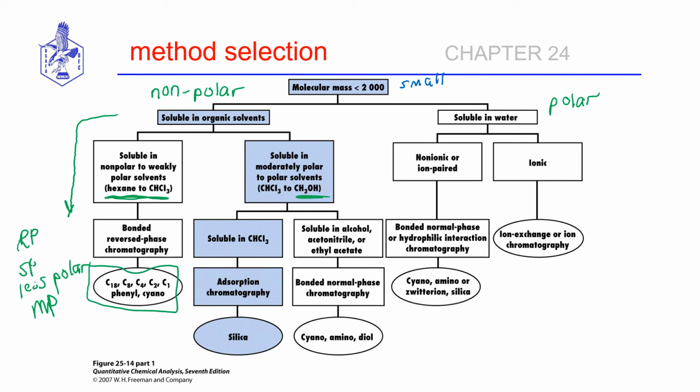If we have nonpolar compounds, but they're not as nonpolar as the previous case, then we're coming down this tree. Solubility in methanol, that kind of thing. And then we want to further discern solubility in different solvents. If we are soluble in trichloromethane, then we might want to consider doing our separation on a bare silica surface, which does not have a stationary phase material bonded.